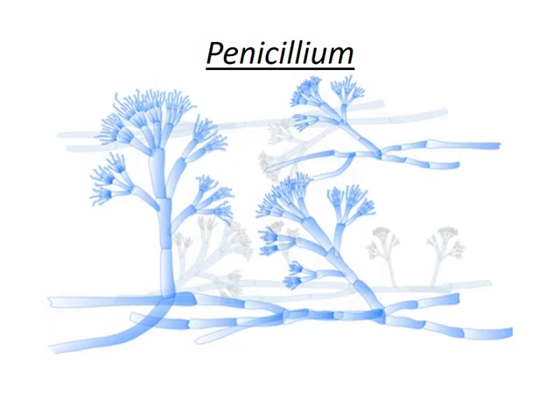This is the microscopic observation of Penicillium species. Again, the structure is stained blue in color because of the stain we have used. What we can see is the mycelium, which is septate — the mycelium is divided into different segments. The mycelium gives rise to the conidiophores that bear the spores we call conidia.